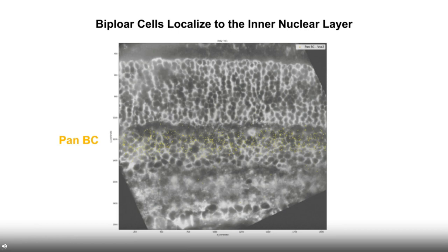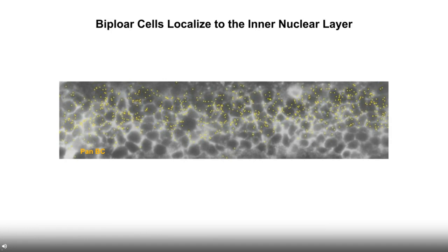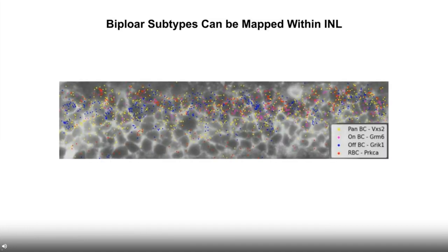Similarly, looking at bipolar cells — interneurons connecting the photoreceptor cells to the RGC layer — the bipolar cell markers highlight the top half of the inner nuclear layer. If you overlay that with subtypes of bipolar cells, like on, off, and rod bipolar cells, you can see the colored dots have a specific pattern that highlights different subtypes.